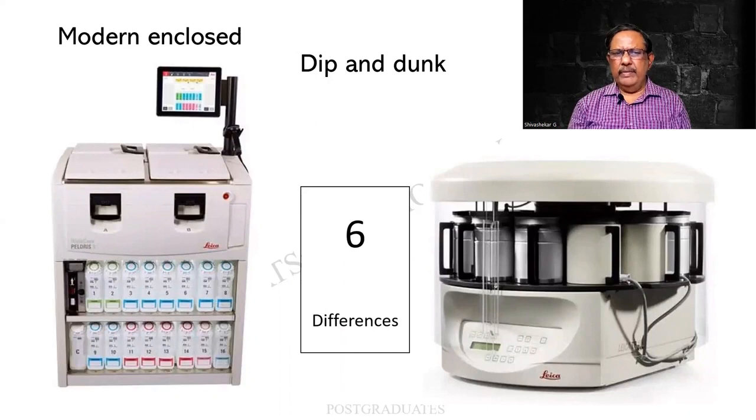The pivot and the lever, etc., are all not there, and there is no master plate over here. Everything is being controlled by the computer. The tubes are invisible through which it will be going on. And once a reagent is old, a red alert is given. It has to be changed.